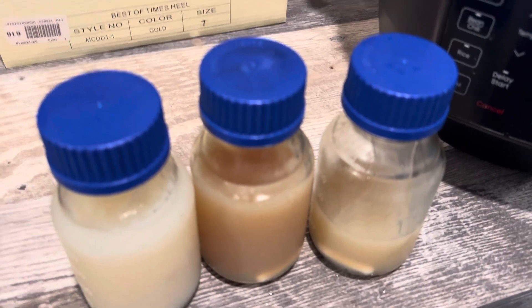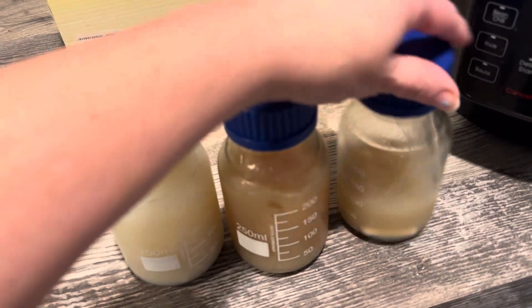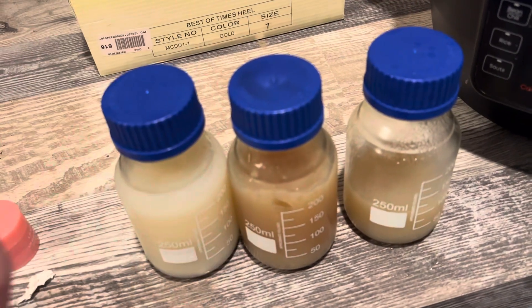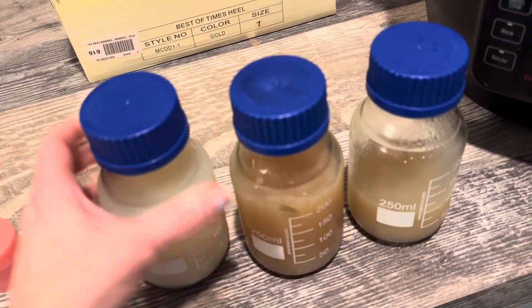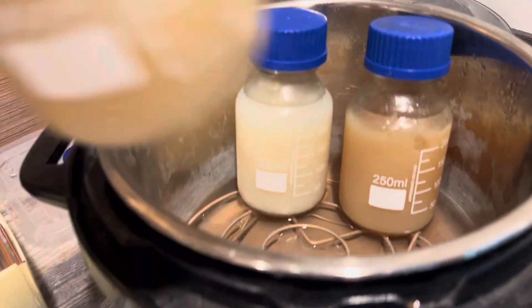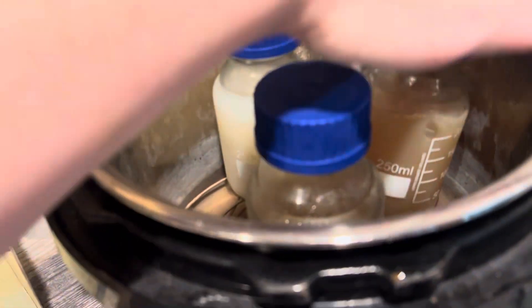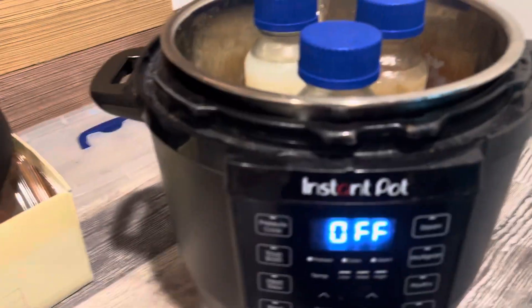One thing that I personally love about these media jars is that I can make a lot of agar at once, and then I can just take my agar when I'm ready to use it, put it in the fridge after I'm done, and then I just put it in my pressure cooker and pop it in there for 15 minutes using the setting to keep it warm.